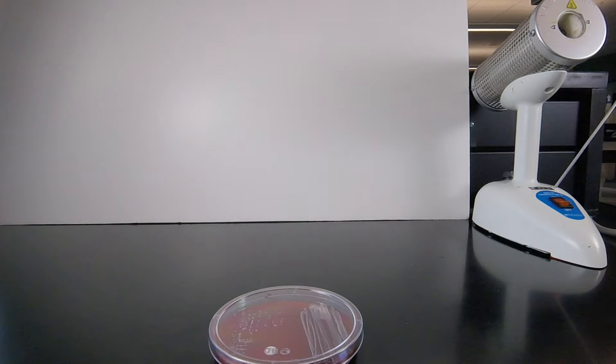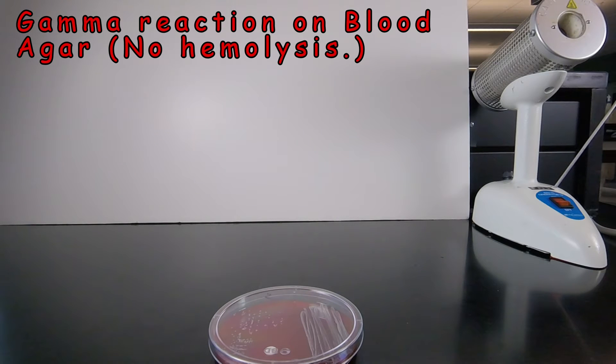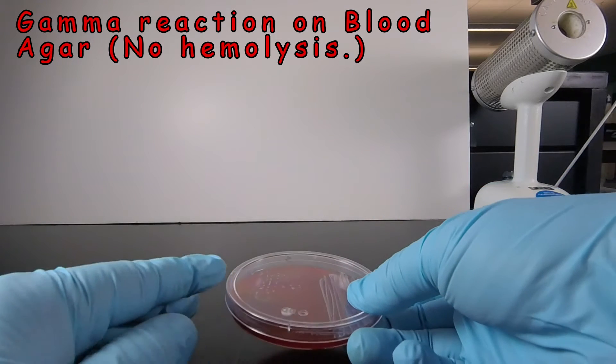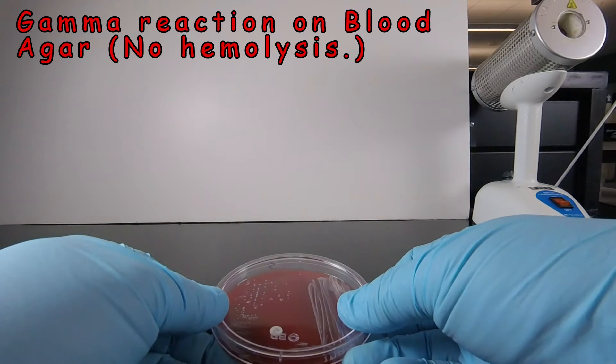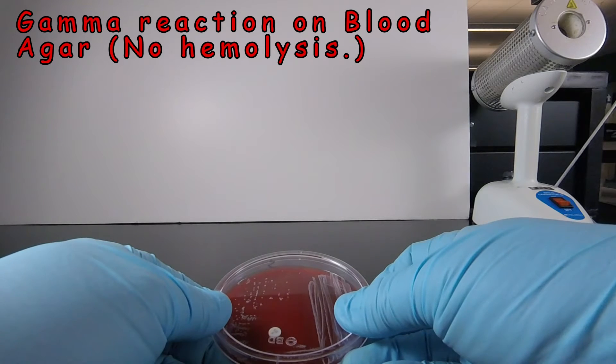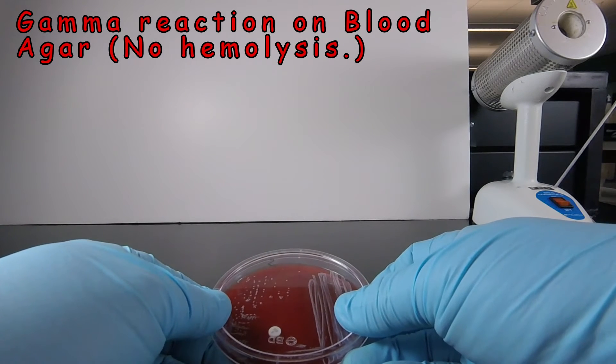This is a plate of blood agar that shows a gamma reaction, or no hemolysis. In this case, this is Staphylococcus epidermidis, which has a gamma reaction on blood agar. That means there's no discoloration of the agar, no lysis of the red blood cells. The blood agar still looks like blood agar — red and opaque.